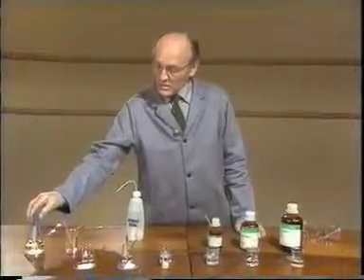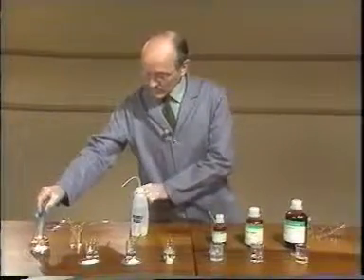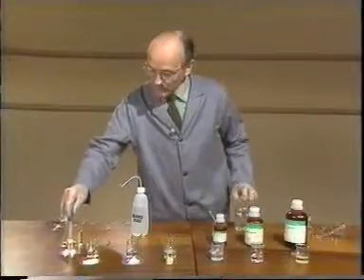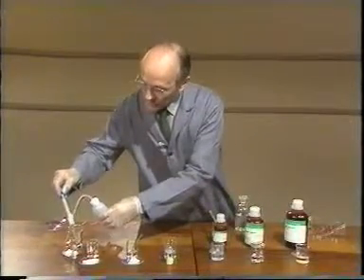Now, there was very little temperature change for sodium chloride and magnesium chloride, so I will measure the pH of these, and while I'm at it, I'll measure the pH of all of the solutions to see if there's a trend. It's most important to rinse the probe, the pH meter, before doing the test.